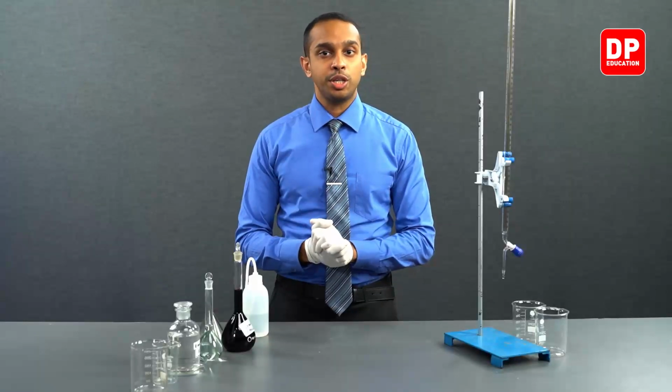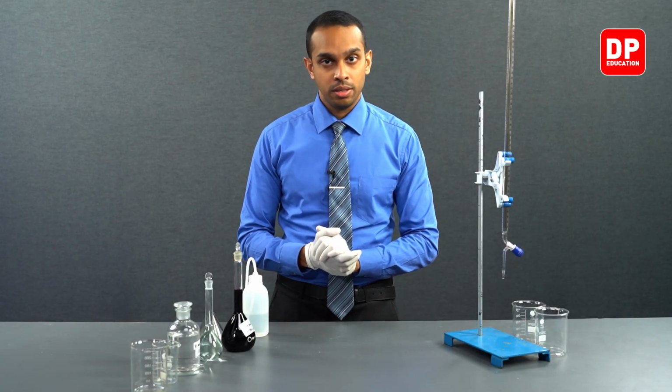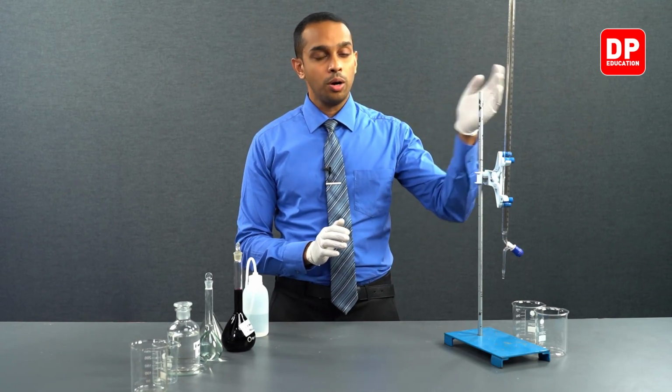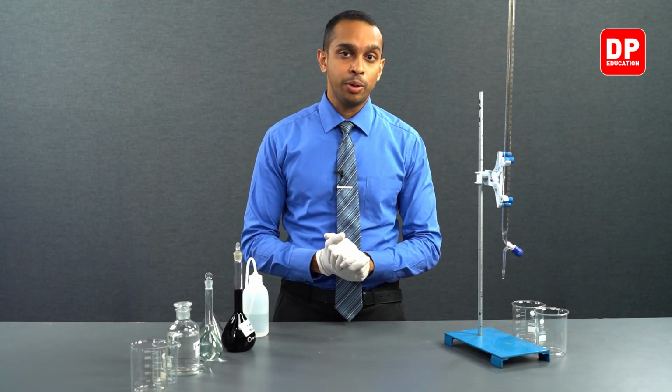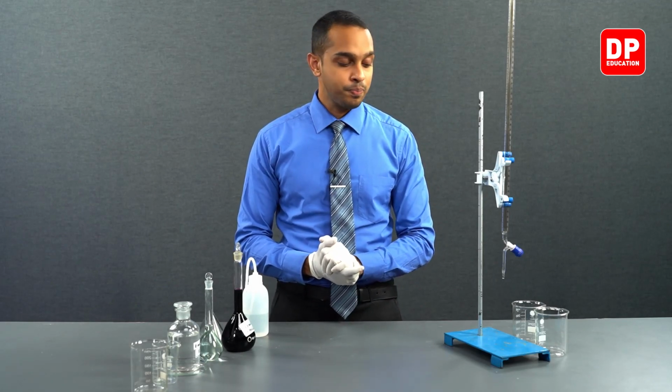Whenever we are doing a titration, we have to know how to use a burette. So let's first focus on how we can clean a burette and then how we are going to fill a burette up.